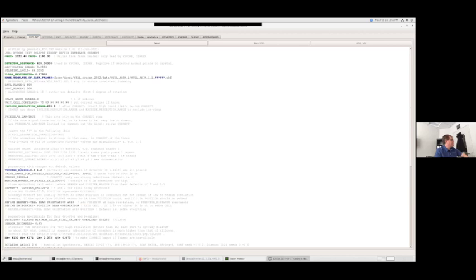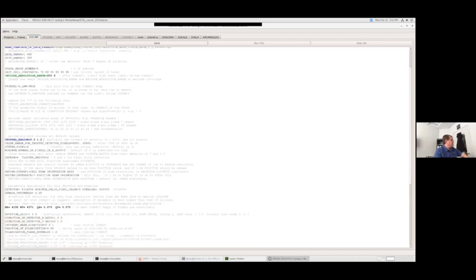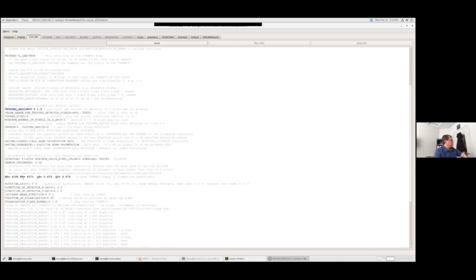All right. After that, these other values are just read in. The default is usually sufficient. Okay. NX, NY is the number of pixels in the X and Y direction. QX, QY is the size of the pixels in the X and Y direction. And that is included here, as it says, to make the correct step happy. It can actually derive this from the frames natively if you have that.